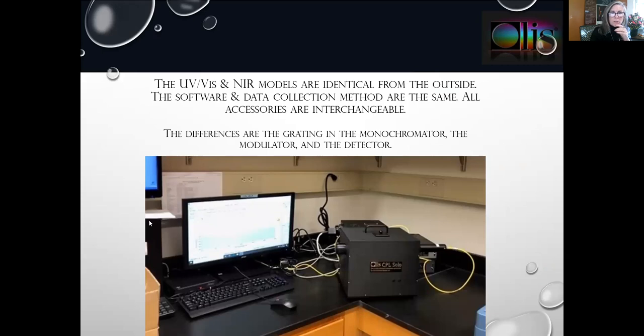The instruments look exactly the same whether they are for the ultraviolet visible or the near infrared — everything that differs between them is on the interior. Those differences include the grating on the monochromator, the modulator (a PEM versus a quarter wave plate), and the detector — a photon-counting photomultiplier tube versus a photon-counting InGaAs detector.